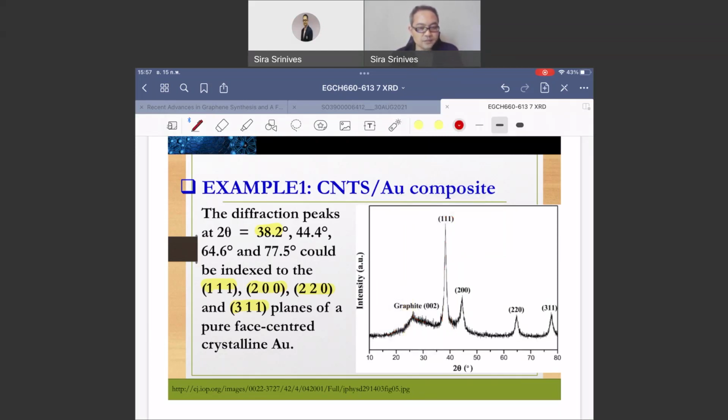So if the transformation in crystal structure doesn't interest you, it's not supposed to be analyzed that way. At the end of the day, XRD still needs to be used as one analytical result along with so many others that you build up to tell the story that you would like to tell. All you need to see is the trend, not a certain peak or a specific thing. You need to see the trend.